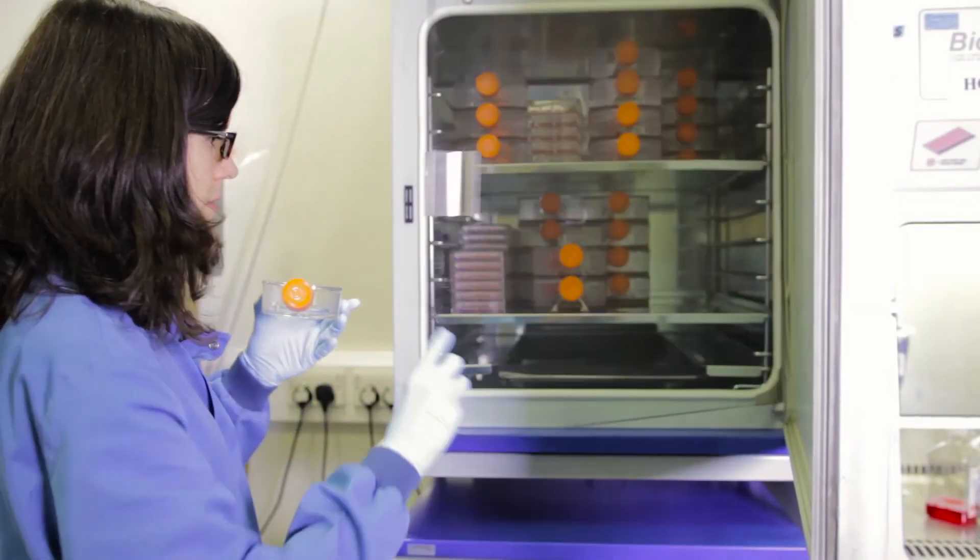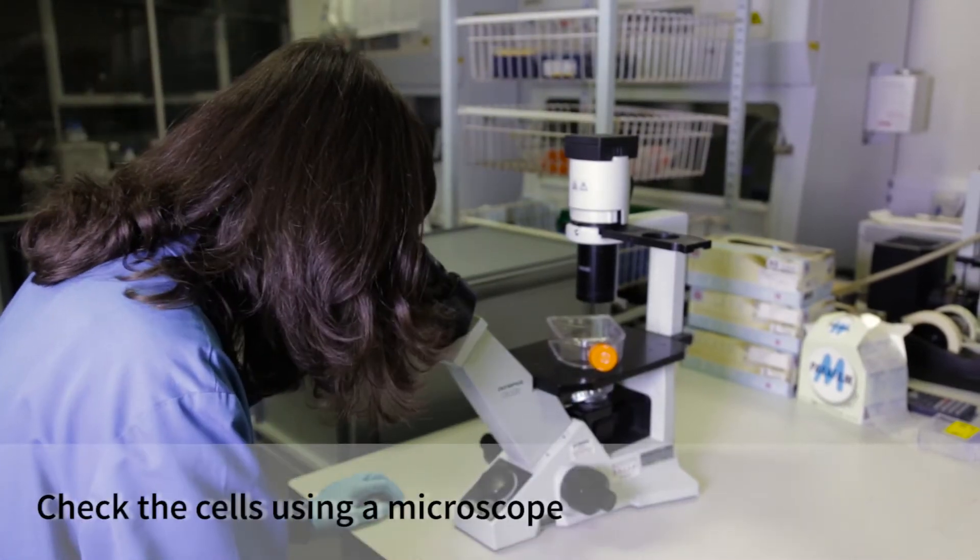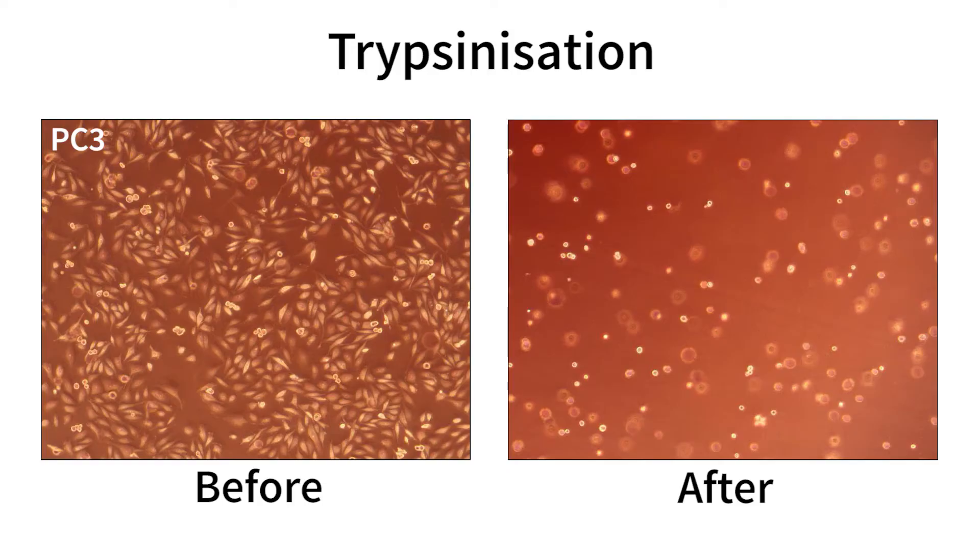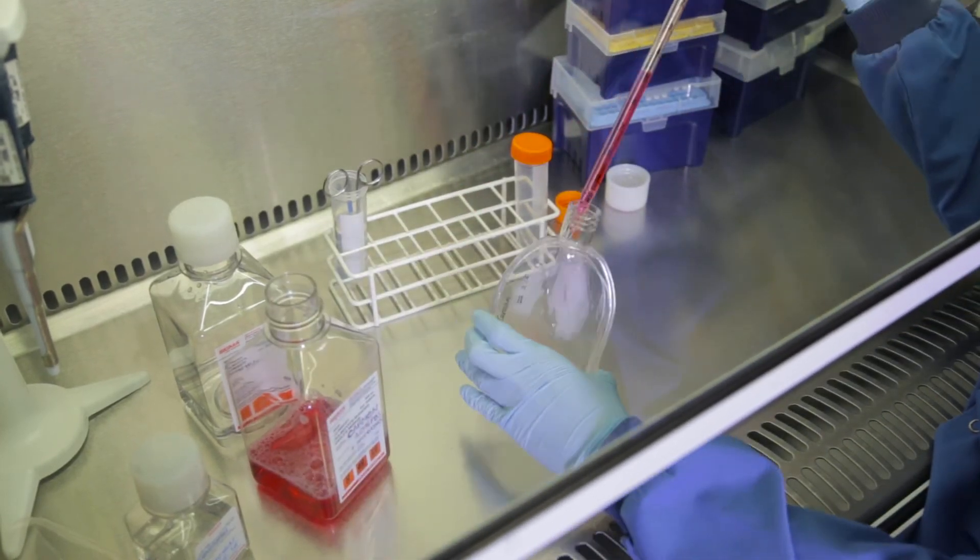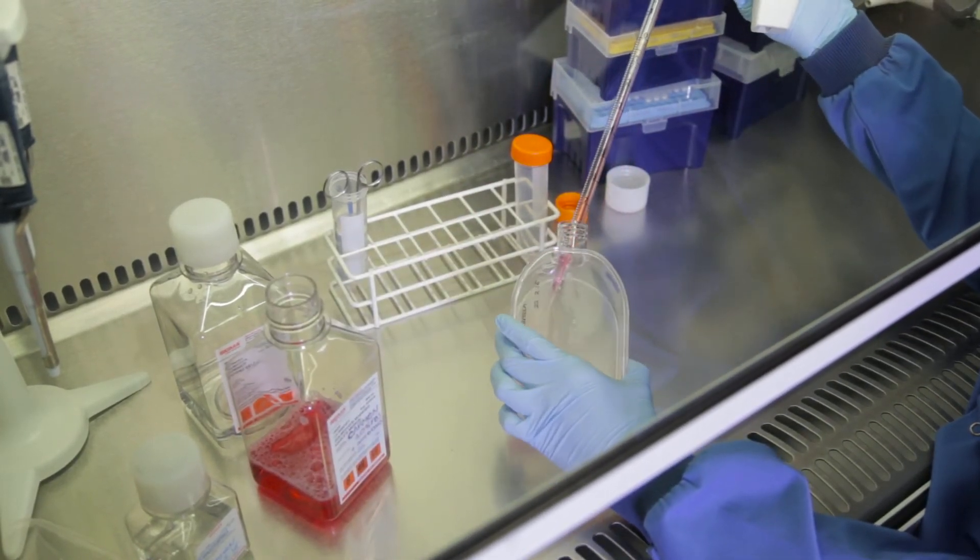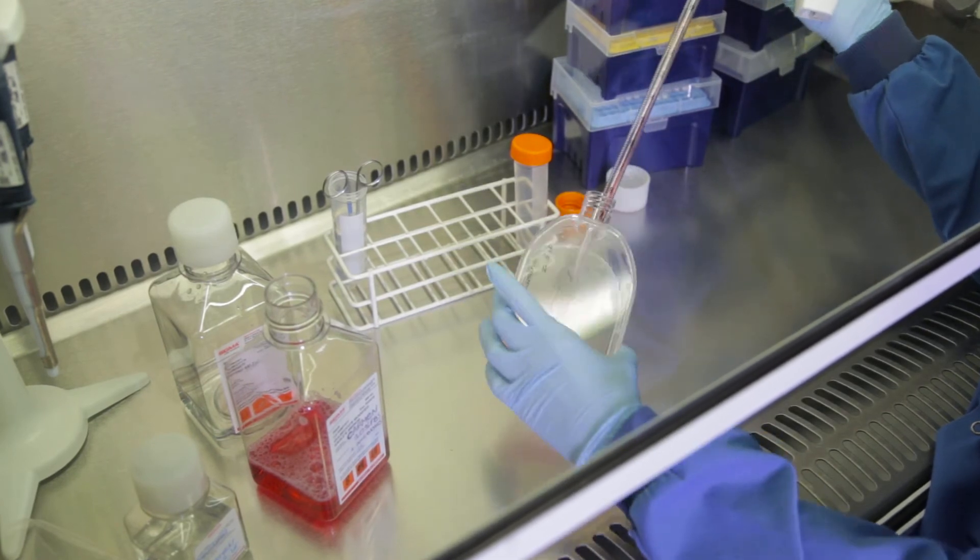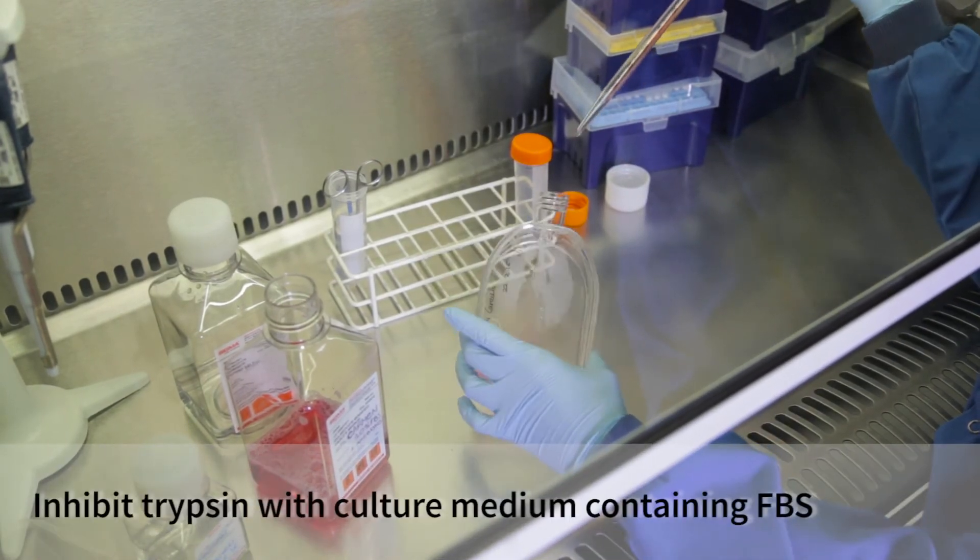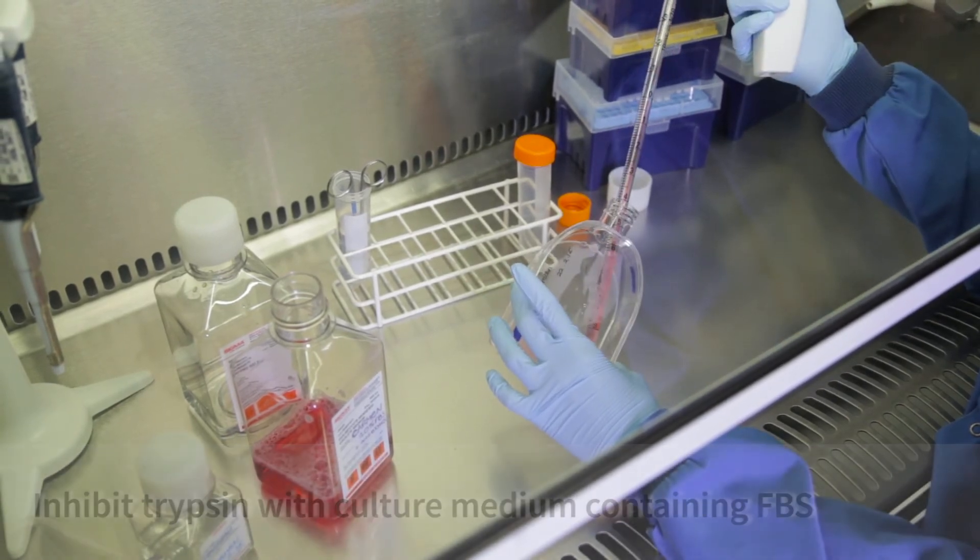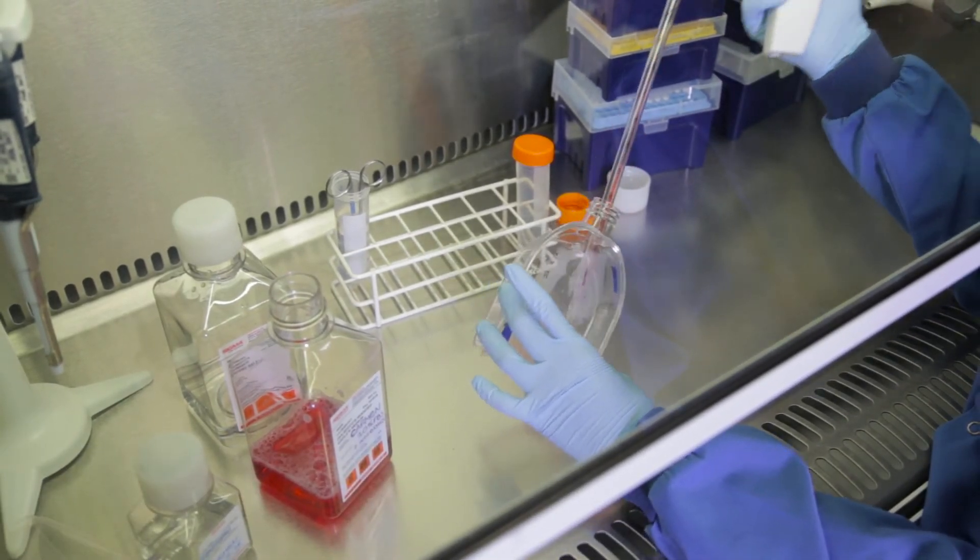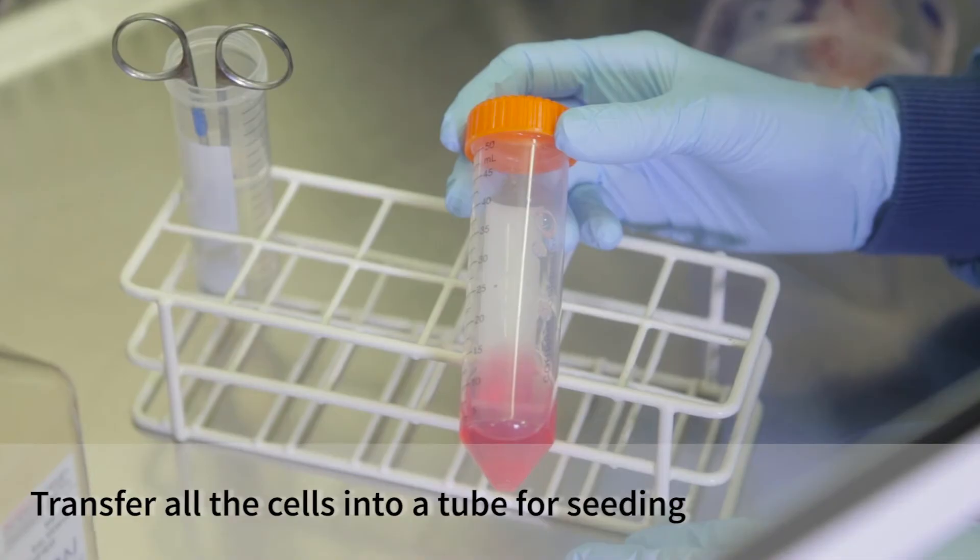All the cells should now be detached. I will check using the microscope. Now that the cells are detached and in suspension, I will neutralize the trypsin, as it might damage the cells if it remains active. I add media containing 10% of fetal bovine serum, which inhibits the enzyme. And I transfer all the cells into a tube before seeding them.